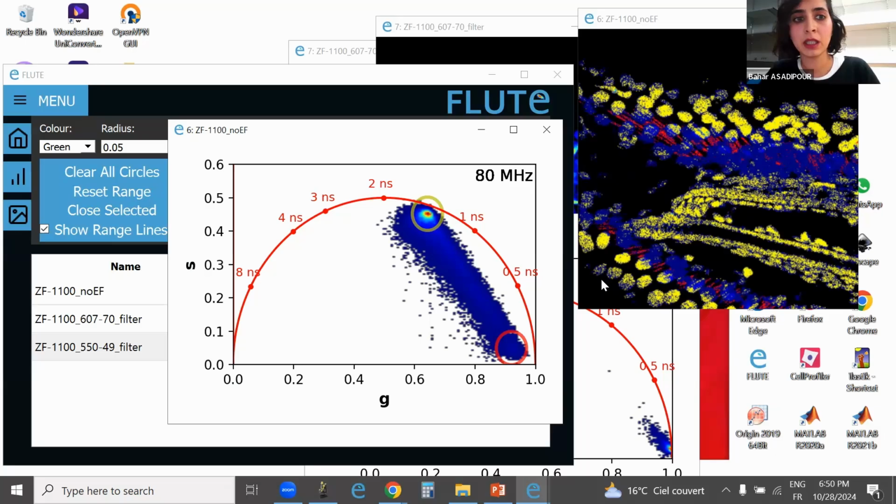You can obtain S, G, intensity, tau M, tau P, and distance from the species that you want from them. In the files that are saved, you can... window tiling. What do you mean?